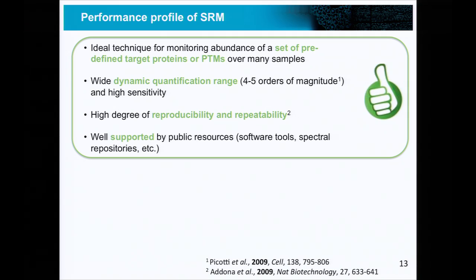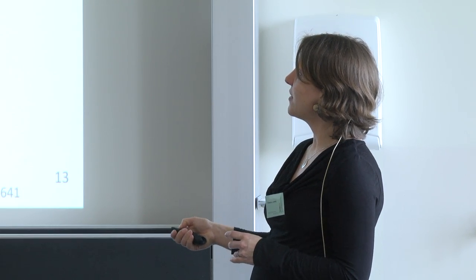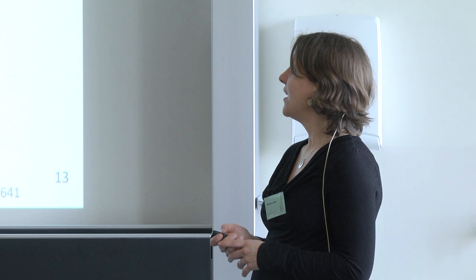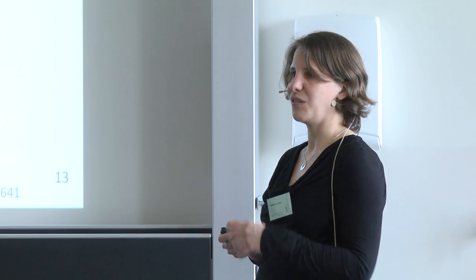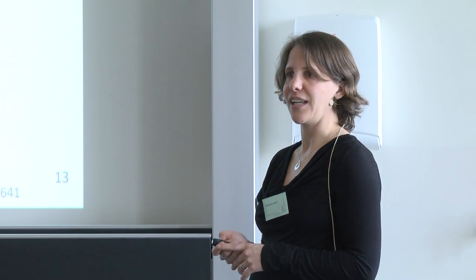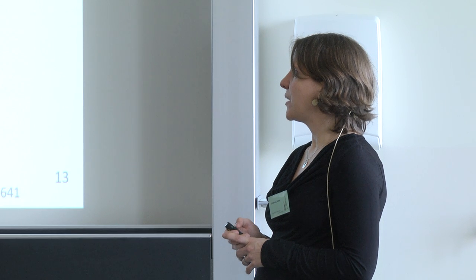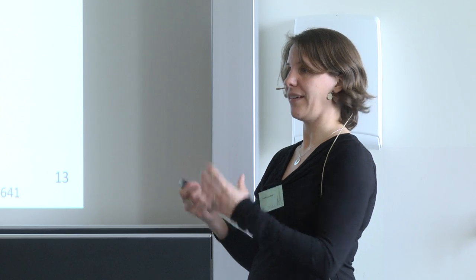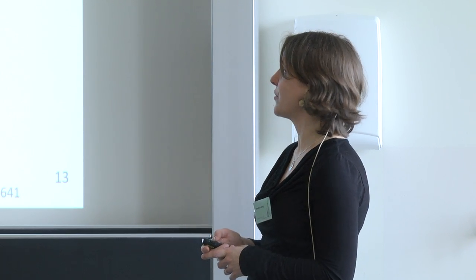SRM is very reproducible and repeatable, so it's again this major advantage of SRM, and you will see, I think, a lot of data throughout this week that shows this. And SRM is, as I said in the beginning, the most established technique of the targeted techniques, so it's well supported already by software tools. You will see Skyline throughout this week, and there are a lot of spectral repositories out there which you can use as starting points for generating targeted assays and so on and so forth. So you get a lot of great software support and repository support.